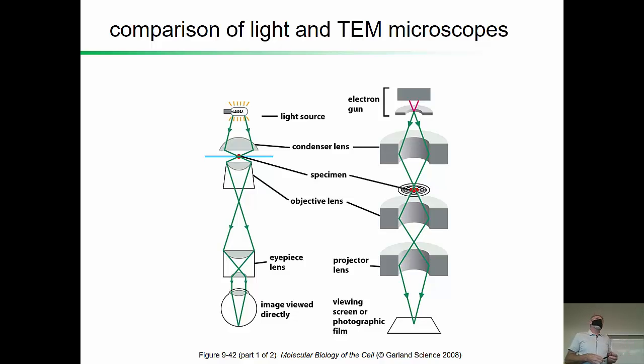And so this allows for much improved resolution. Keep in mind, you can't do electron microscopy on living samples. So unlike all of the light microscopic techniques, which have the potential to be done on living samples, depending on what the sample is and how the preparation needs to go to visualize them, we don't have that option with electron microscopy.